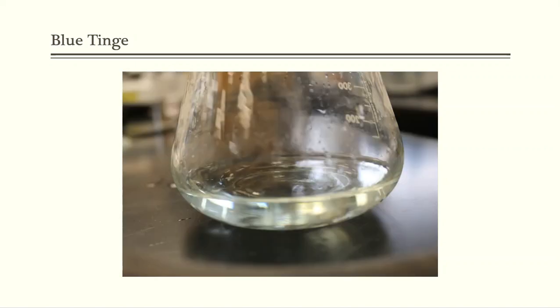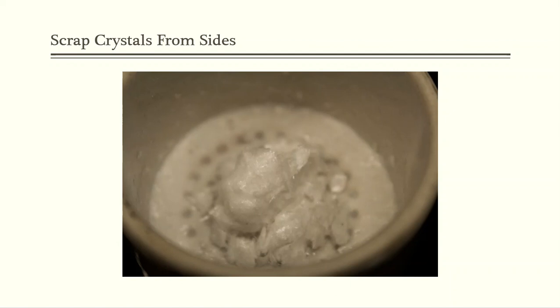All right. Notice that down here, this liquid that's getting poured through is not as bluish in this picture, but there is a blue tinge to that solution. So again, this is a very good sign that that blue contaminant did dissolve and stay dissolved in my recrystallization process, so that way we could remove it quite easily.